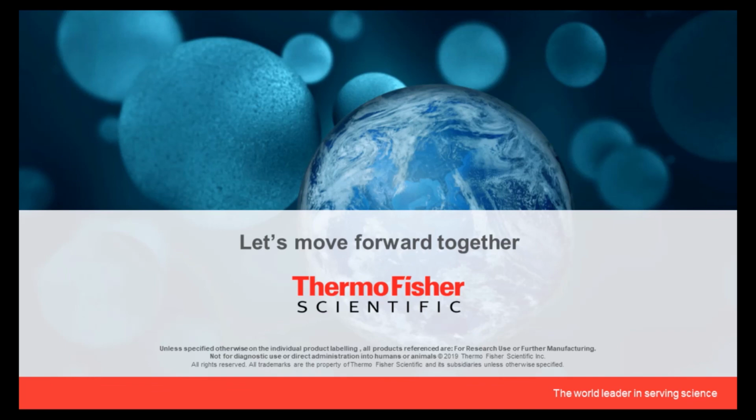Okay, and on a similar line, can a customer supply the ligand to Thermo? Absolutely. If you have a ligand that you've manufactured yourself, you can supply that to Thermo. We've done that on the Poros side of the business a number of times. We basically set you up as a vendor within our system so that we're able to acquire the ligand from you, and that's definitely a possibility.